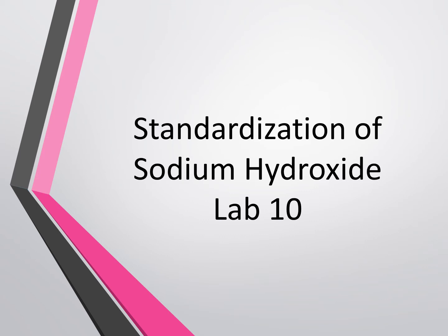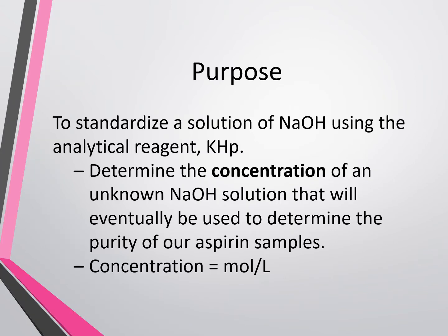This week in lab, we'll be doing the standardization of sodium hydroxide. The purpose of this lab is to standardize the solution of sodium hydroxide using the analytical reagent KHP, or potassium hydrogen phthalate. So we'll be determining the concentration of an NaOH solution that we will eventually use to determine the purity of our aspirin that we made a little while back. And remember that concentration is in units of moles per liter.